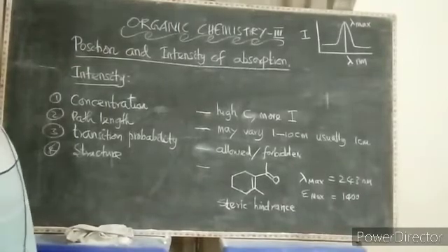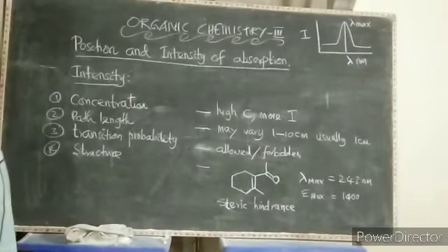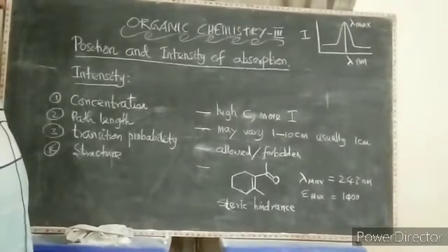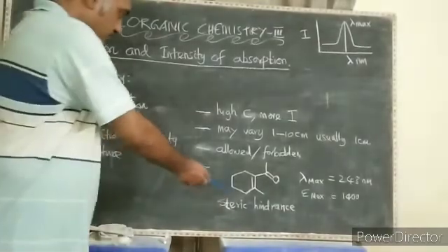Then the fourth factor is structure. The sample molecular structure also affects the intensity. For example, we can take this compound.